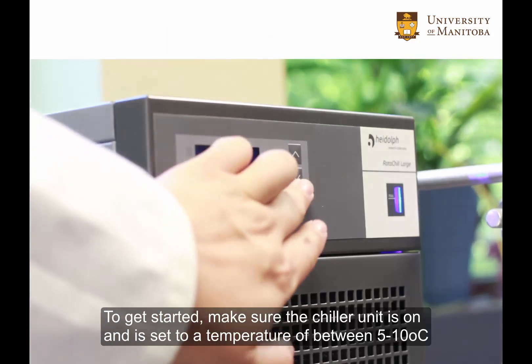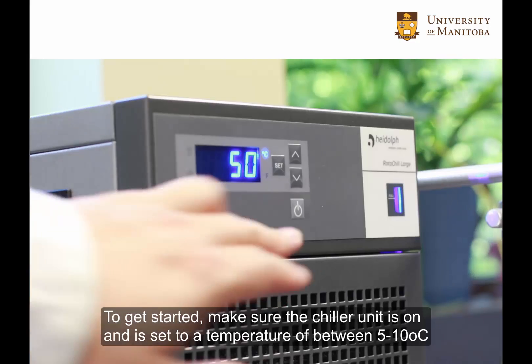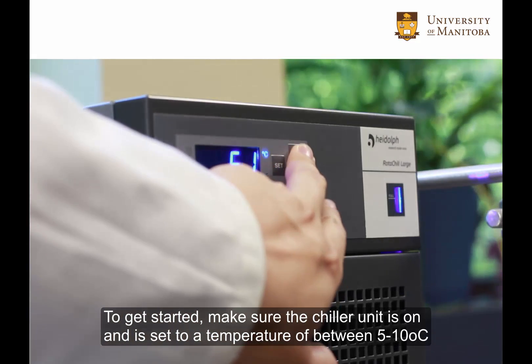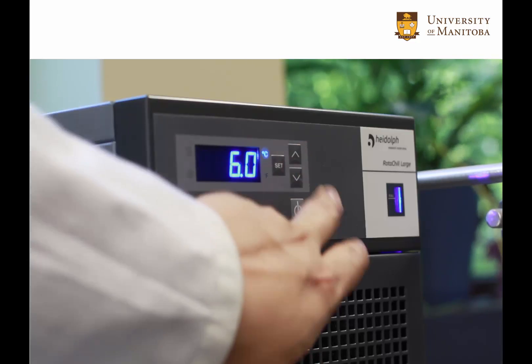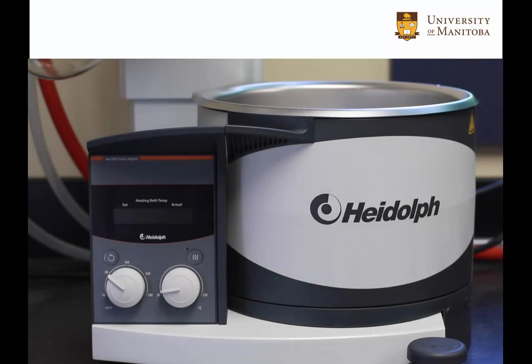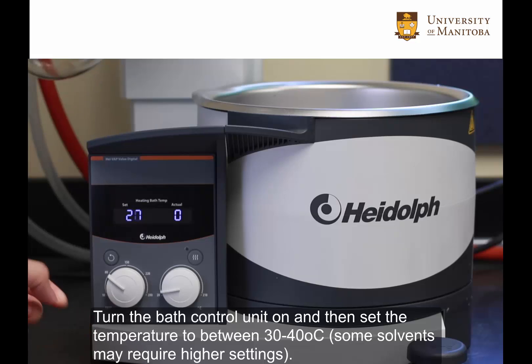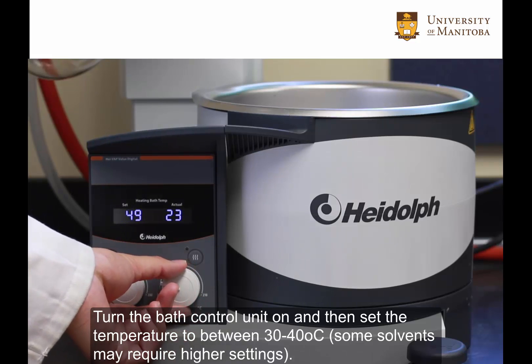To get started, make sure the chiller unit is on and is set at a temperature of between 5 to 10 degrees Celsius. Turn the bath control unit on and then set the temperature to between 30 to 40 degrees Celsius. Some solvents may require higher settings.